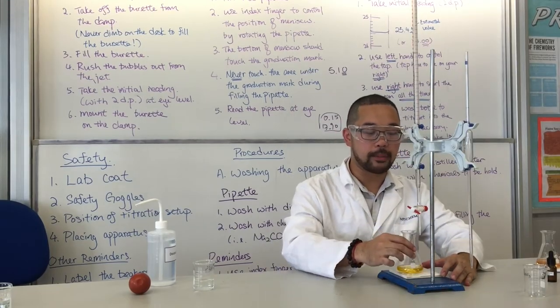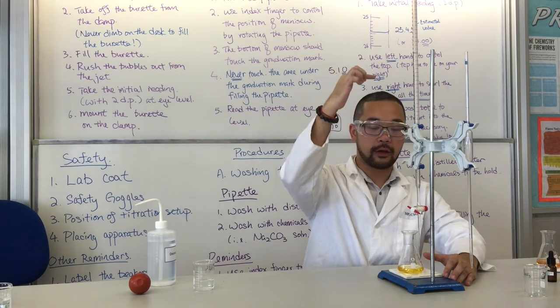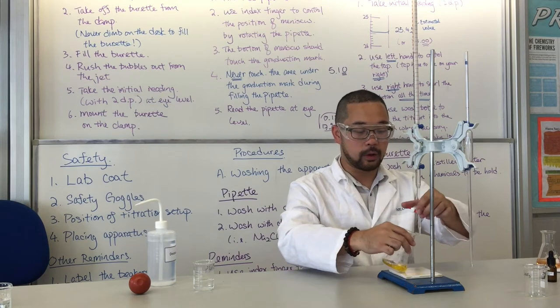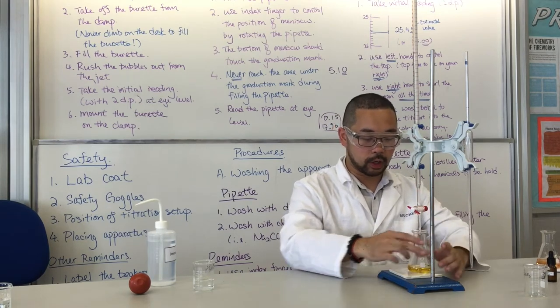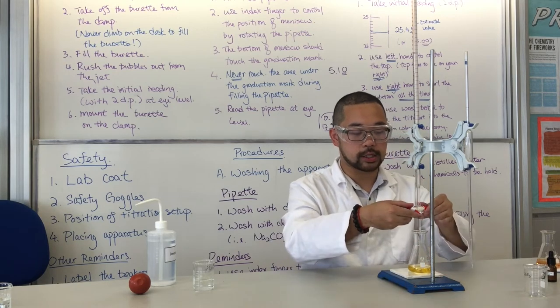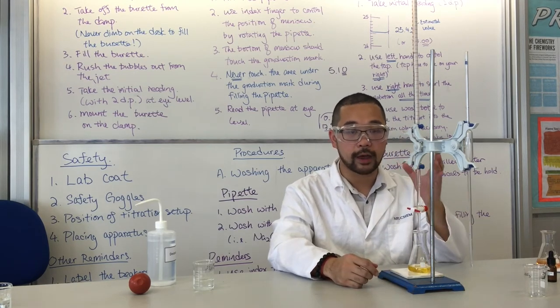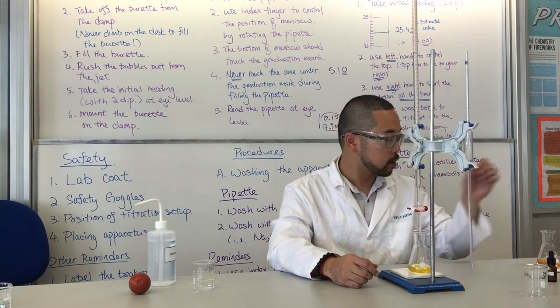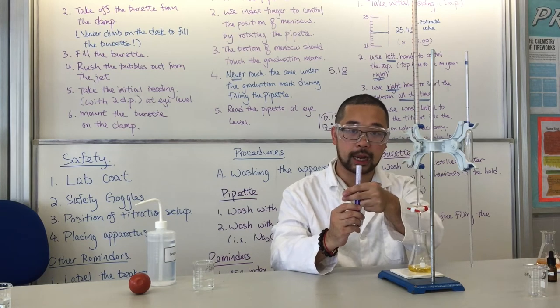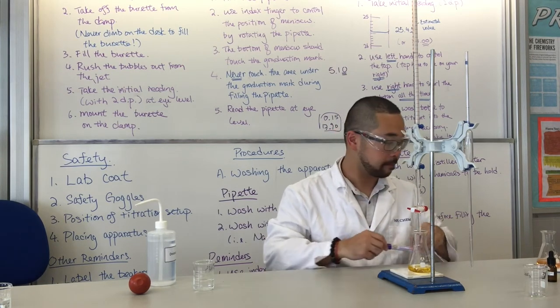Titrations. Remember, before you start the titration, you have to check the initial reading. After that, you have to put down the reading onto the worksheet. Now, put the conical flask in position. You should notice that the tap will be on your right hand side. You're going to use your left hand to control the tap. So your hand will be like this, clamping on it just like a clamp, and controlling the tap on the right hand side.